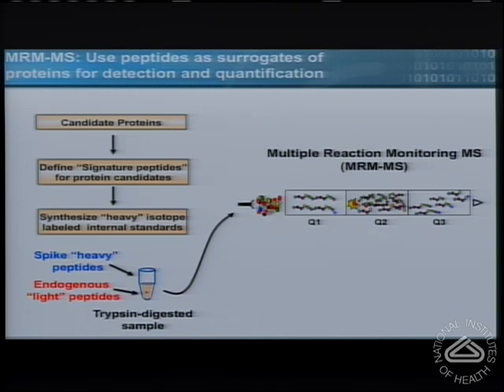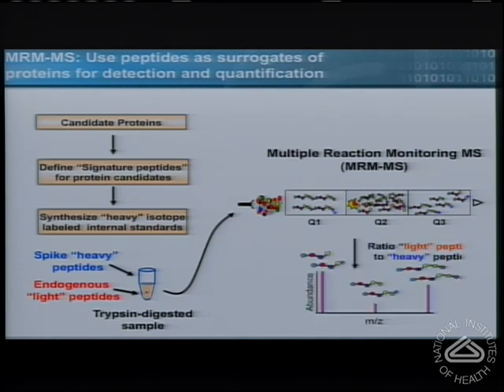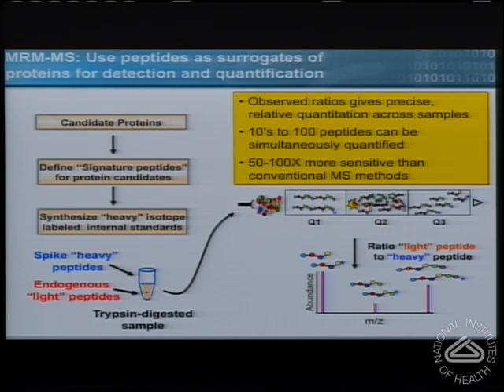And this is the MRM technology. Don't worry too much about this. I only want you to understand the following. Samples are being sprayed out of the liquid chromatograph. We select specific species in the sample. These are the peptides, the heavy and the light version of the peptide that we want to monitor. We break them apart, and then we analyze only a small set of the fragments, not all of the fragments from these peptides. All of this is done to increase our cycle time, our throughput. And then we take the ratio of the analyte peptide to the spiked-in peptide. Pretty simple. What's important here is that these ratios give us precise relative quantification. We'll come back to this.